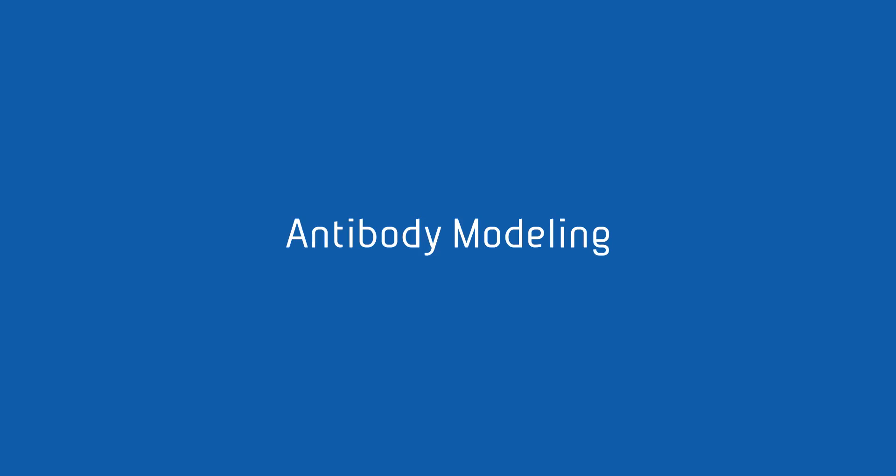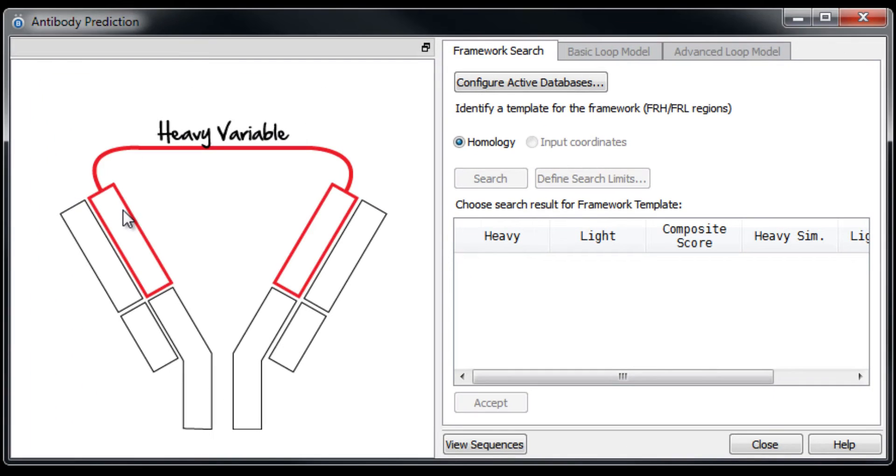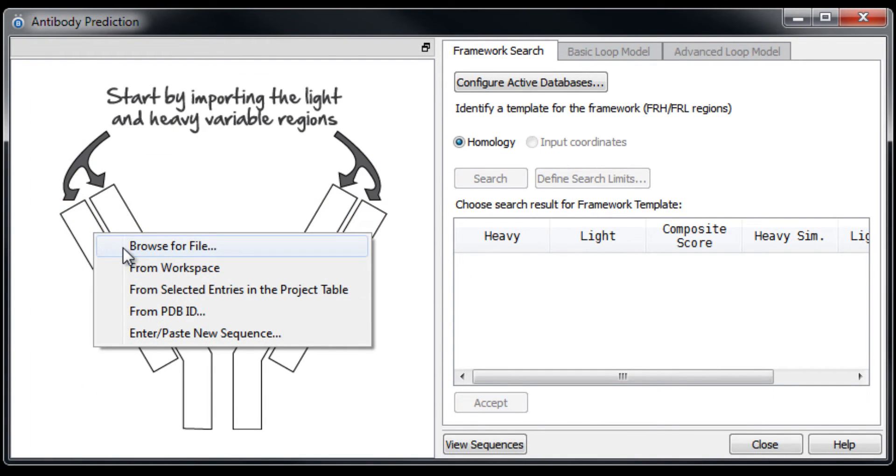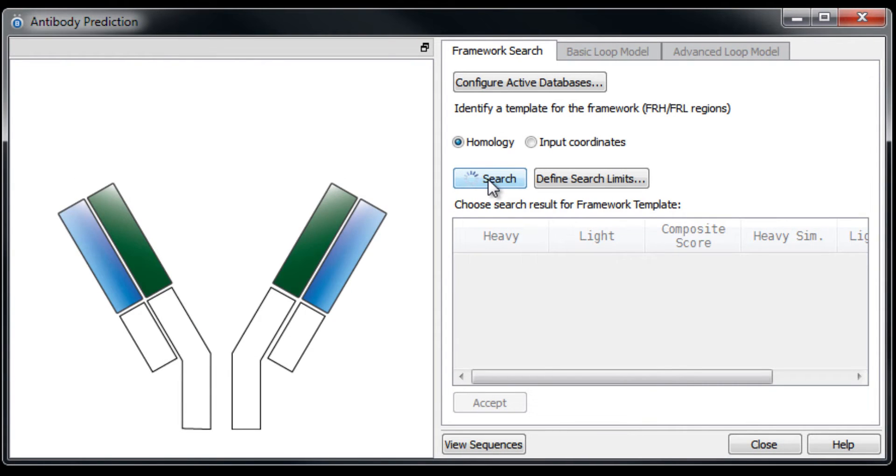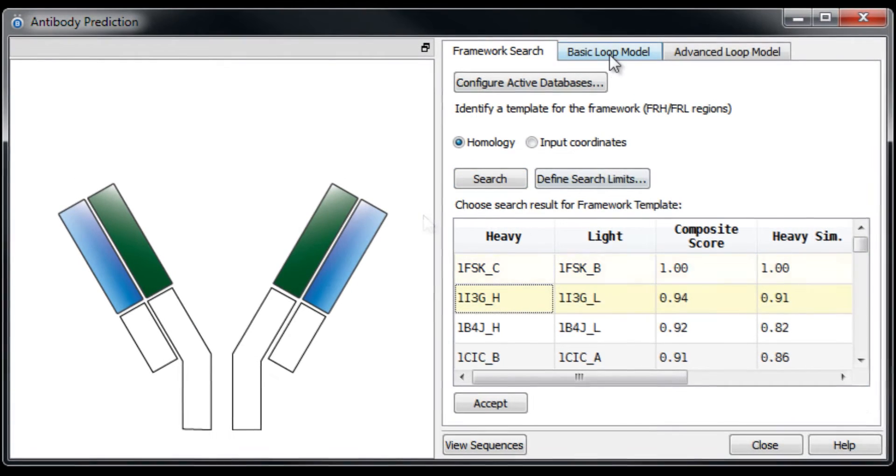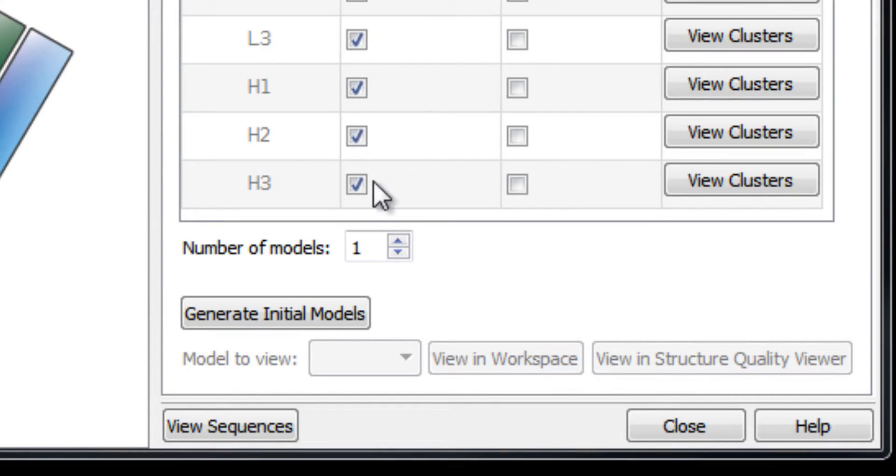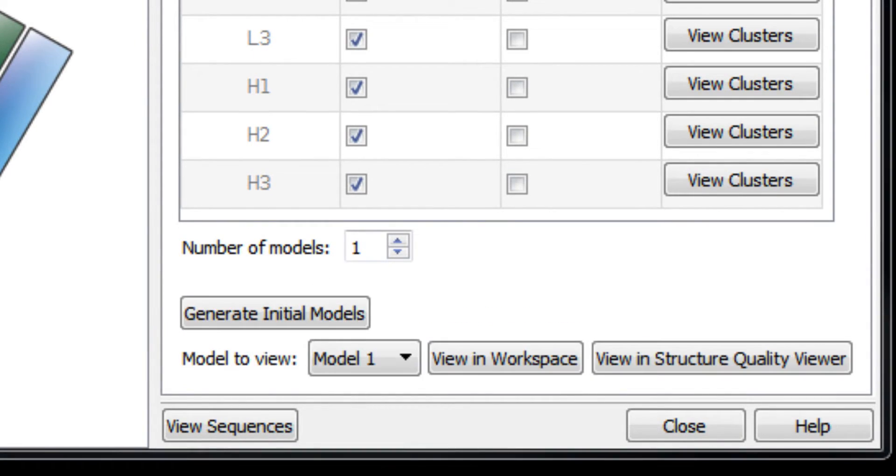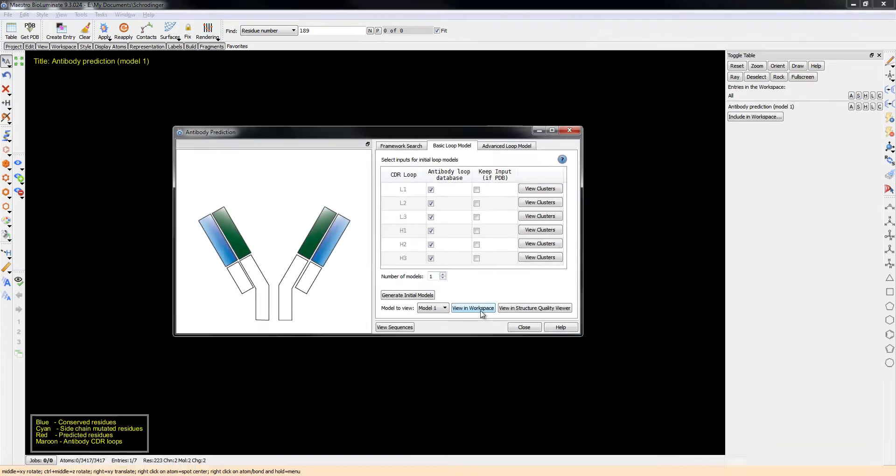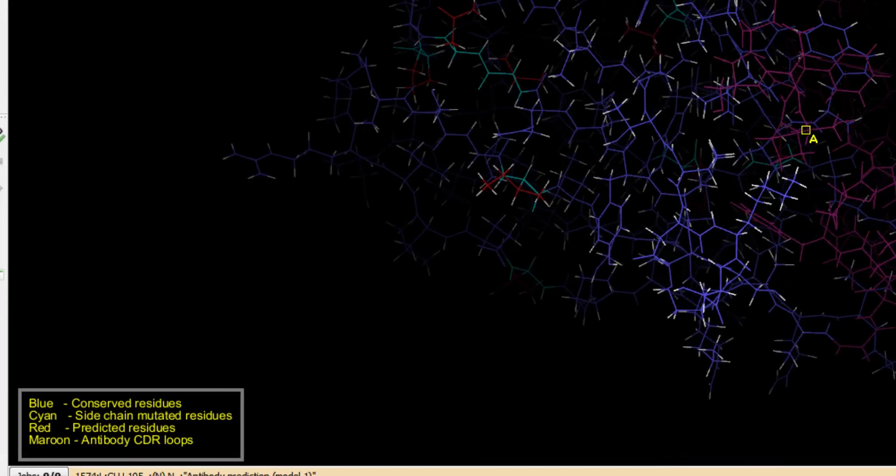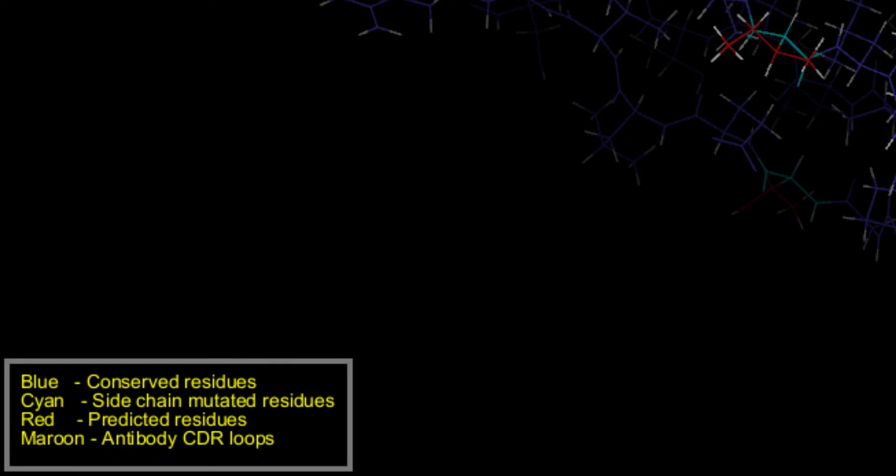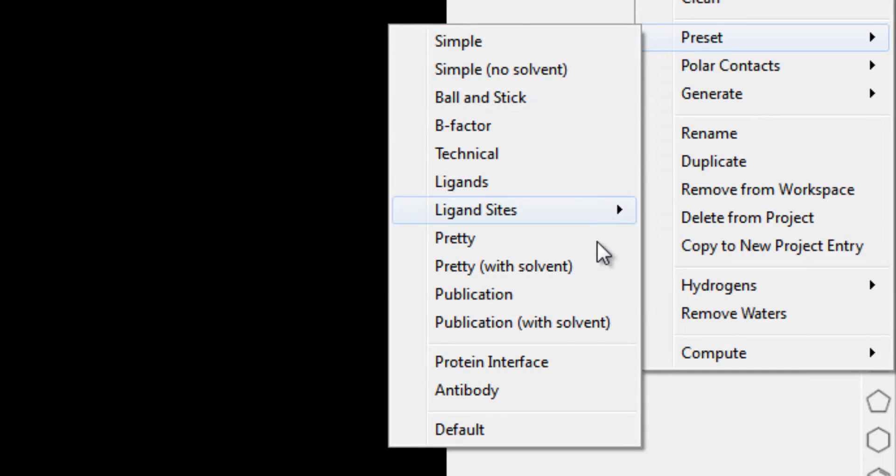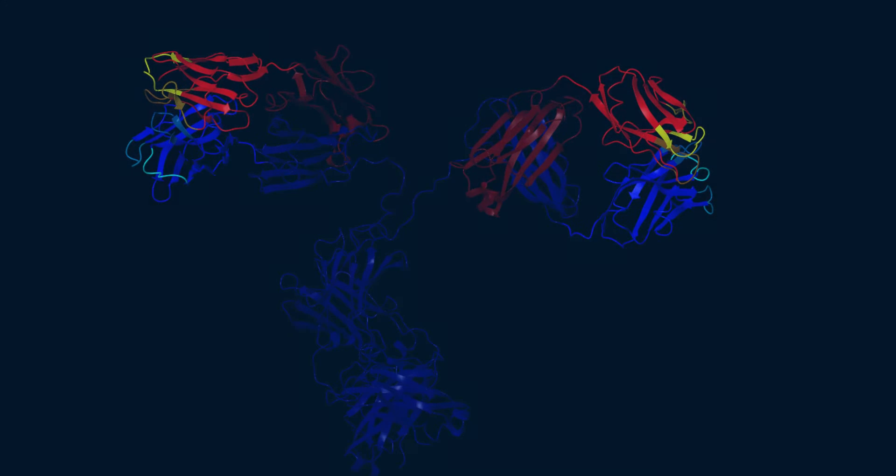Antibody modeling is made easy in BioLuminate. Use the antibody prediction panel to define sequences for the heavy and light variable regions. Search curated databases for ideal framework templates and hypervariable loop regions, then generate initial models for subsequent refinement. View models in the workspace with default colors representing unique structural regions like CDR loops, or use action presets to set up antibody-specific representations.